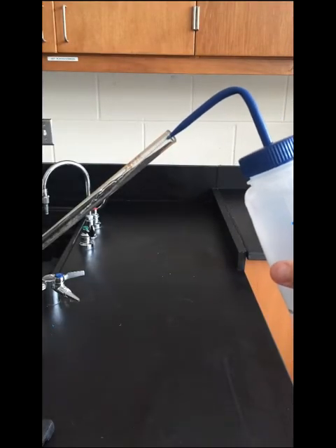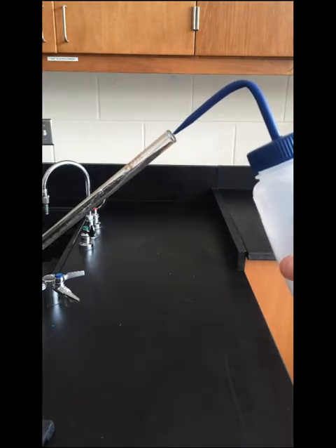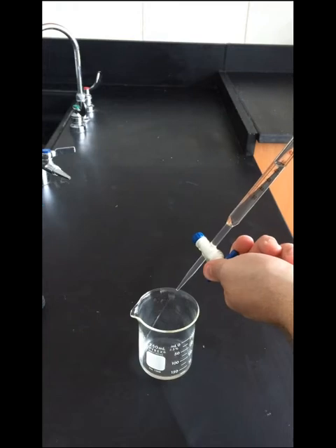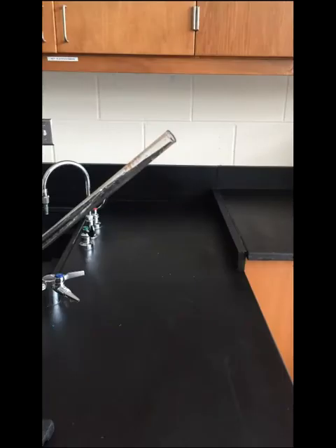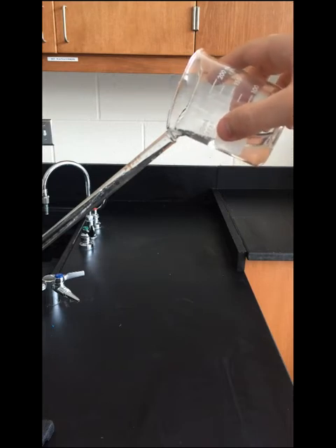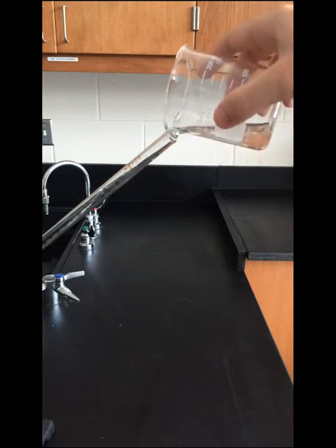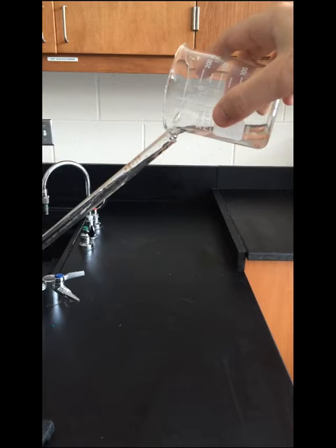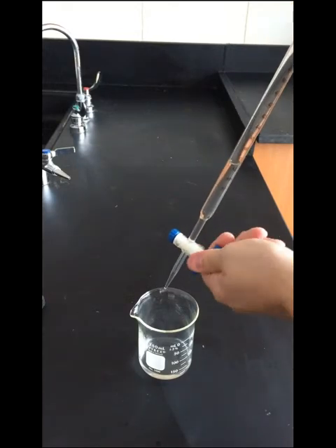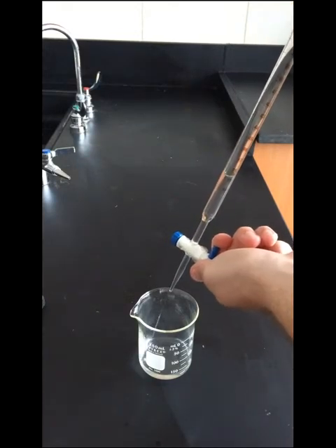Deionized water is added to the burette to clean it. The deionized water is then drained. We then add about 5 milliliters of the 0.5 molar sodium hydroxide to prime the burette. This solution, too, is also drained into a waste beaker.